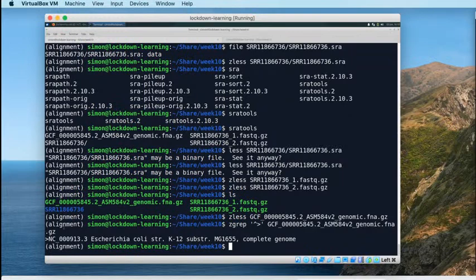What we're going to do first of all is transform that reference genome using the Burrows-Wheeler transformation. The way that we're going to do that is by doing a Bowtie process called build. So we're going to use Bowtie2 to build an index for our reference genome. Before we can do that, we need to install Bowtie2. We're going to install it in the same way as we've been installing all of our bioinformatics software so far, so we're going to use Conda to do that installation.